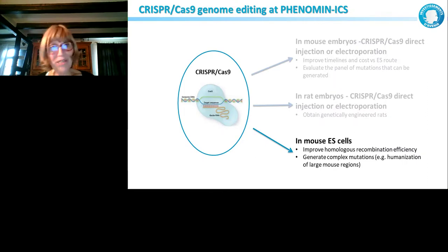Now, more or less to finish, I showed you already one example about CRISPR-Cas9 in mouse ES cells, because we also use CRISPR-Cas9 a lot in mouse ES cells, to generate very complex alleles. These complex alleles, I told you, are very difficult to obtain by microinjection and reconstitution into eggs. That's why we still use mouse ES cells.